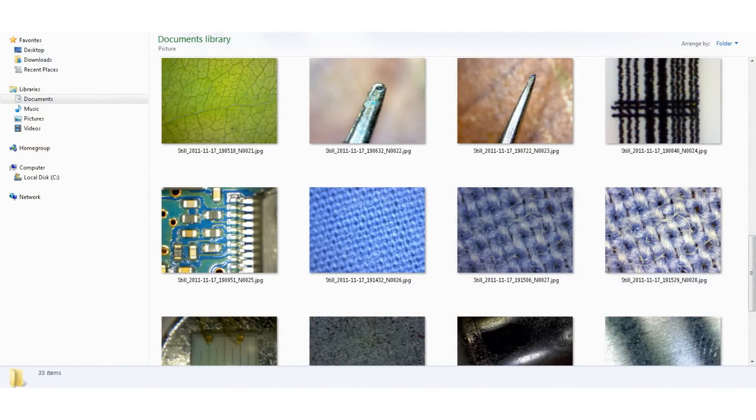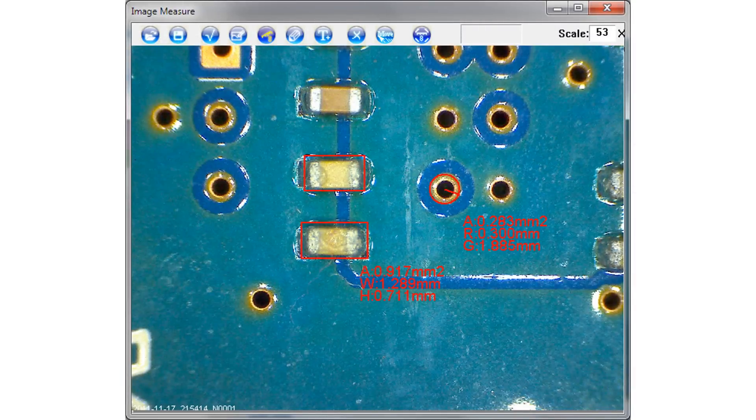The software has an important feature that lets you measure things by drawing circles and polygons around objects. It works well, but first you have to manually read off the scale and type it in. It would have been nice if it could internally get a reading of the scale setting.